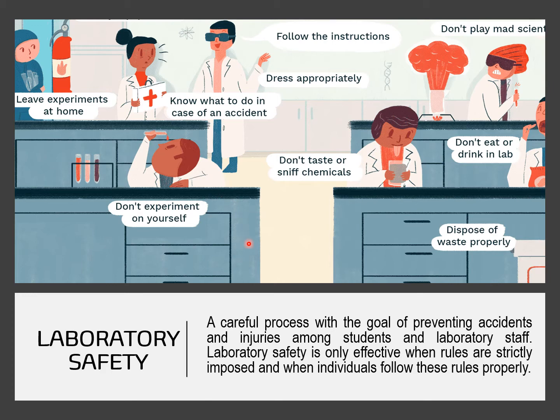Remember our universal precaution that we need to treat all laboratory specimens as though they are potentially infectious. We also have here another person. He is tasting the chemical he is experimenting on. This is also very wrong because we do not know the nature of the chemical. It could be corrosive, so once it comes in contact with your tongue, it might disappear.